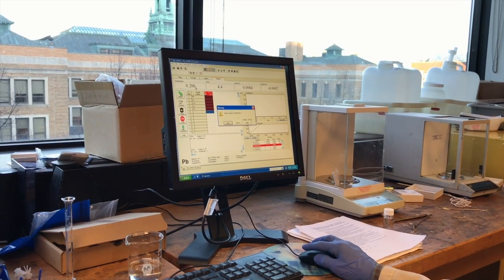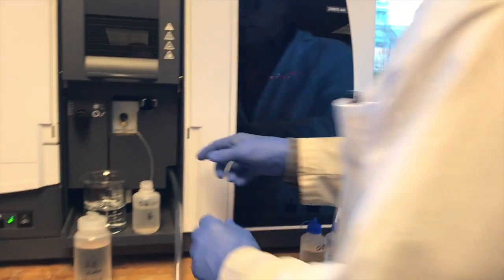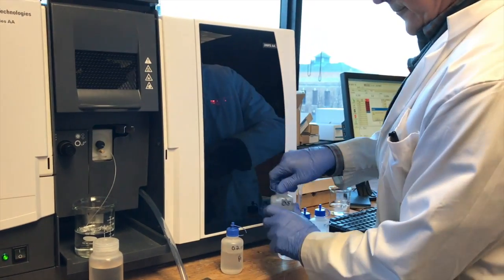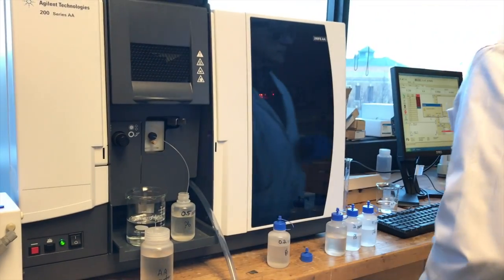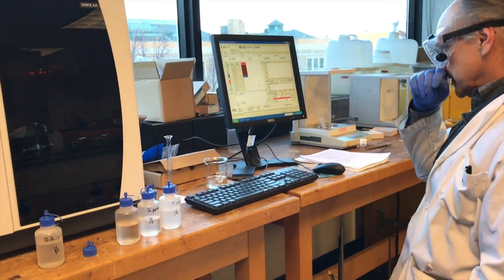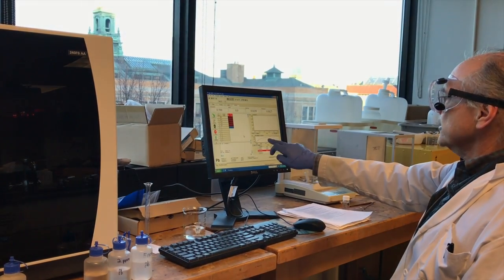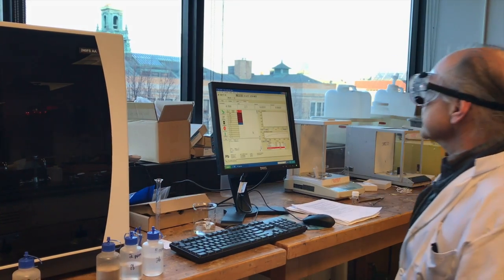Three beeps — concentration is 0.2 and that's the mean absorption along with the relative standard deviation. Now it says present sample two — calibration standard two. Into the DI water first, and number two is 0.5 ppm because that's how we set it up. Now as we read — there's the delay — it's starting to draw the calibration curve. Three clicks and you get a message.